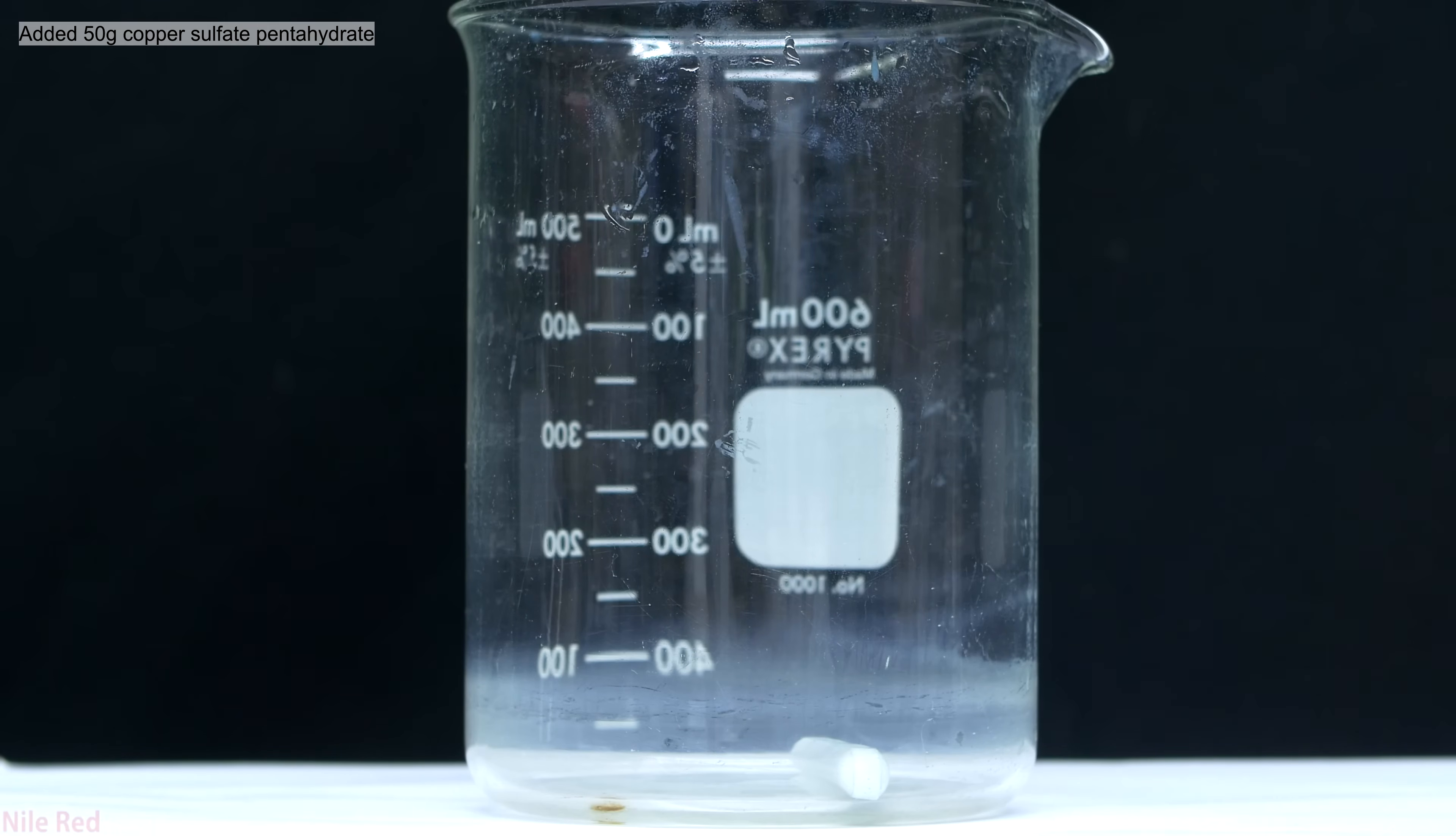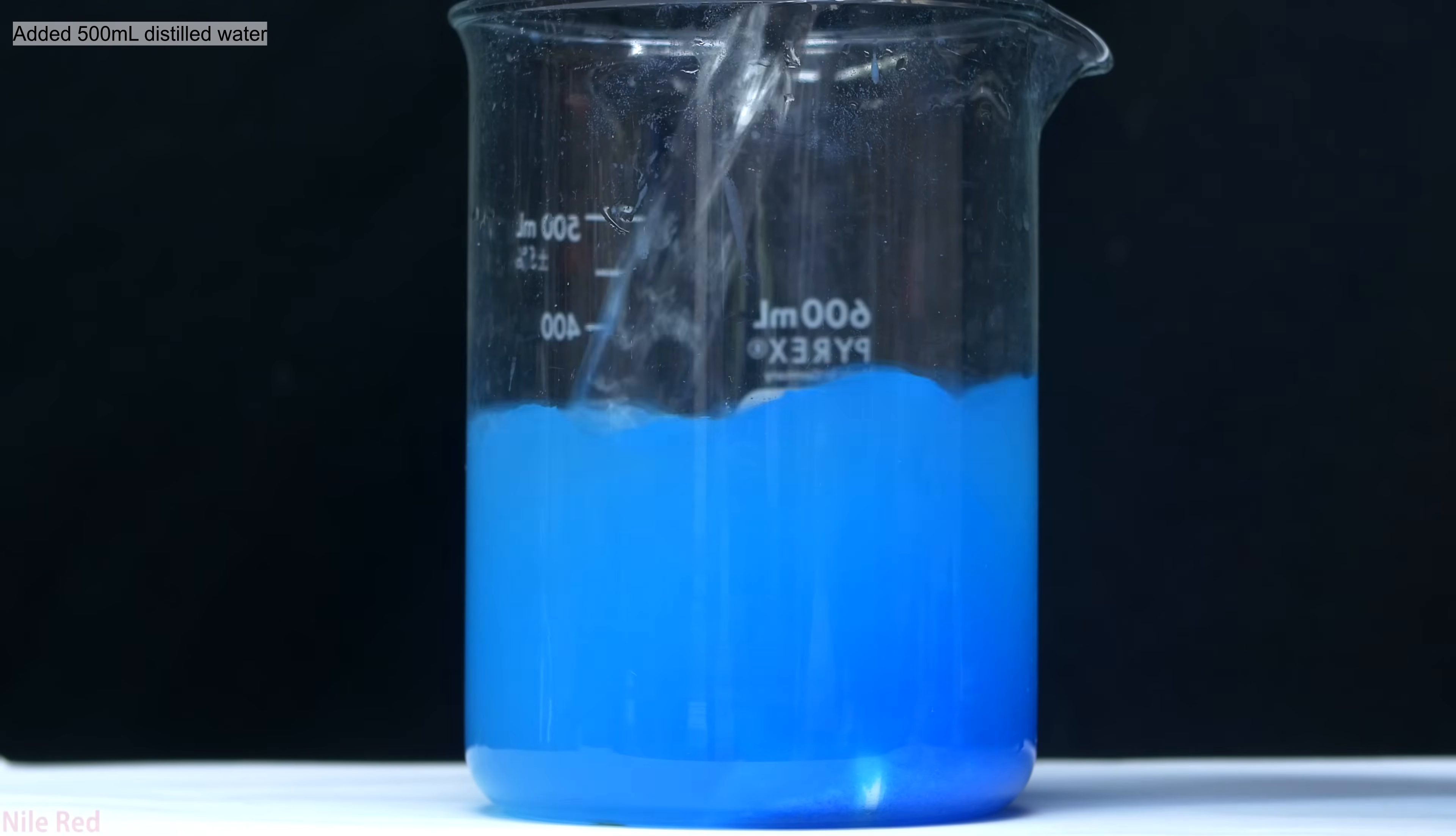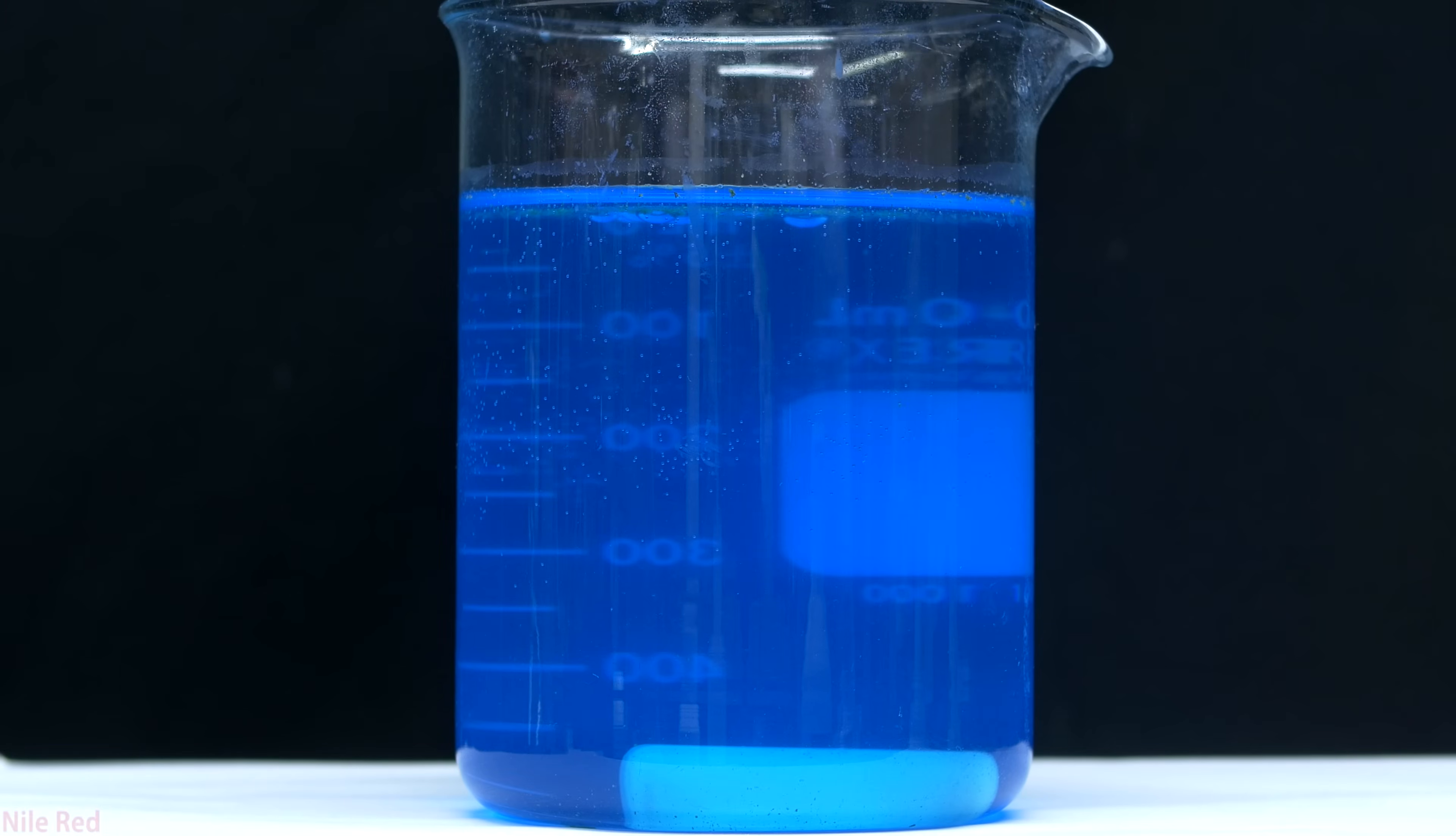I started off by adding about 50 grams of copper sulfate pentahydrate to a beaker. I then added in about 500 milliliters of distilled water to dissolve the copper sulfate. I have a magnetic stir bar inside and a magnetic stir plate below, so I turn that on to get things mixing. Eventually all of the copper sulfate dissolved, and you may not be able to see it here, but there was a lot of impurity floating around.